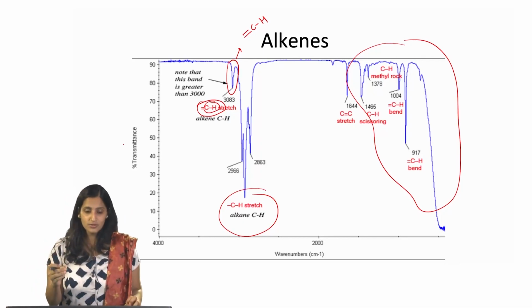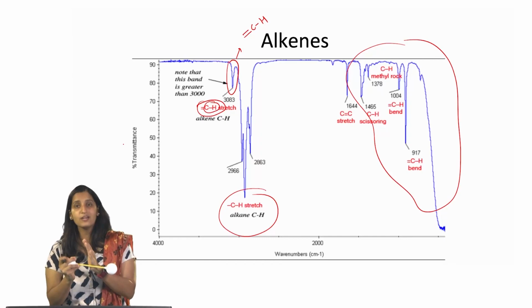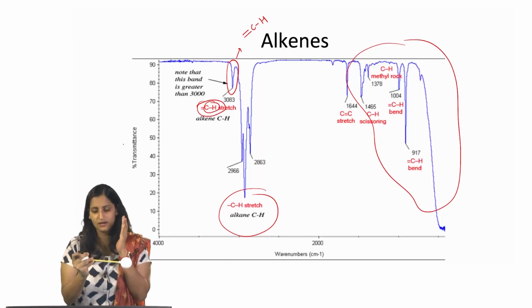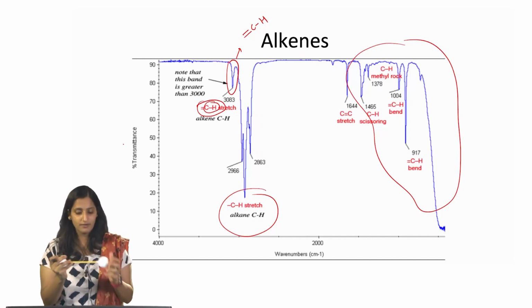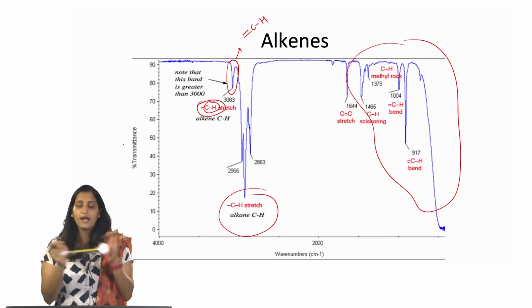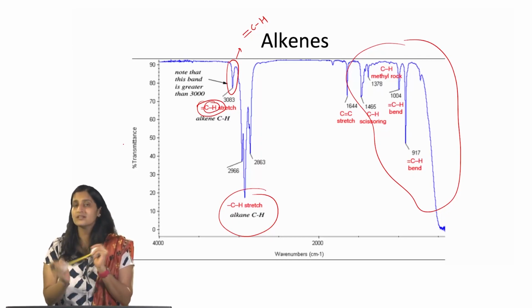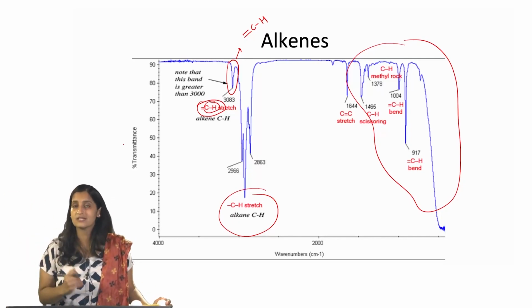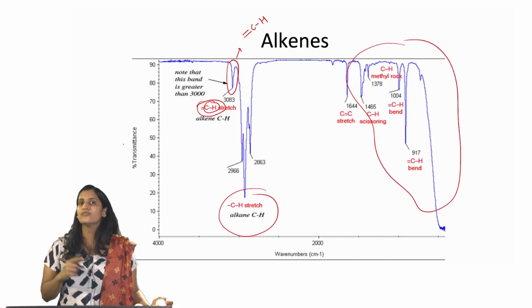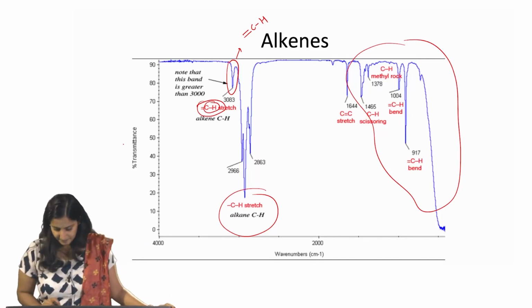Okay. And I know this is not an extensive tutorial, so I will not be going into too much detail, but I just want you to think of it this way: you take a molecule, you shine infrared light, or radiation belonging to the infrared region, on it, and the molecule is going to start vibrating and stretching. We are going to measure what the energy differences between these transitions are, and we are going to figure out what kind of bonds are present in this particular molecule.